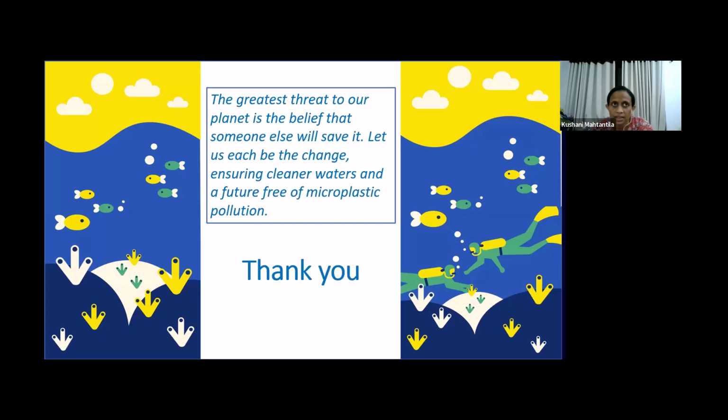So in that sense, the GC pyrolysis will be fine, but in the fish flesh, the particle size should be very small. Once we homogenize the sample, the amount of sample should depend on the limit of detection of pyrolysis GC.